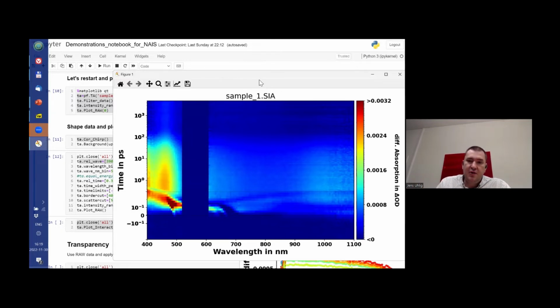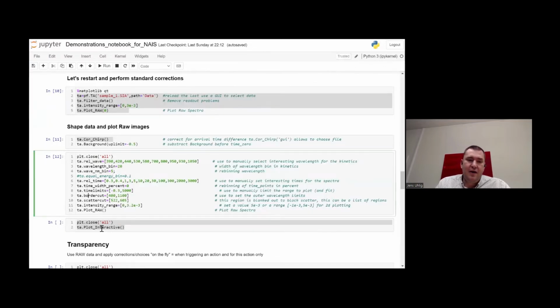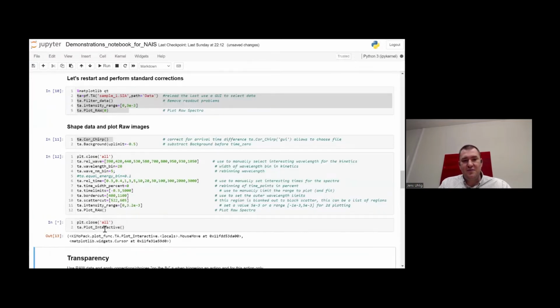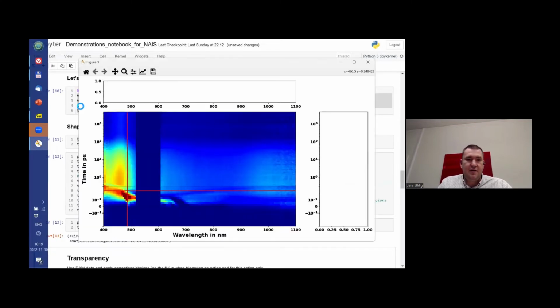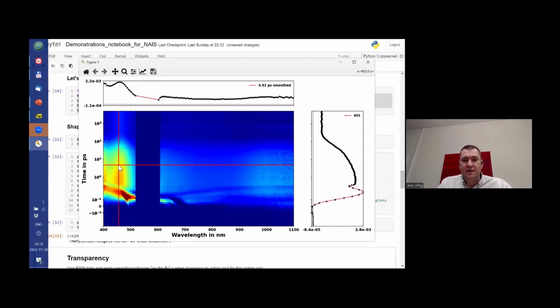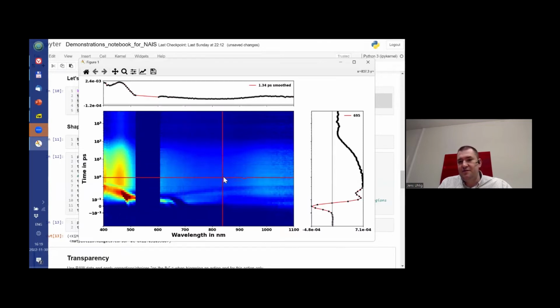If I would like to have a documented analysis, I use here the sample name, which is just the file name. And I keep that one in the plot, because that tells me later, if I look at the plot, what I have done. If I really want to have interactive experiments, I can do that too. Now I can call an interactive plot, also with a single line, and play myself with different slices and do whatever I want.